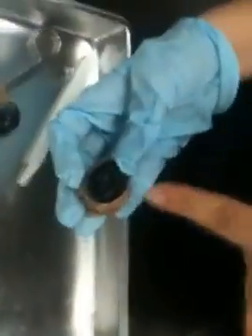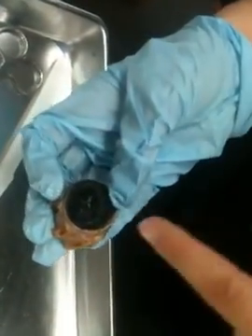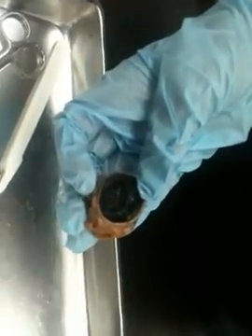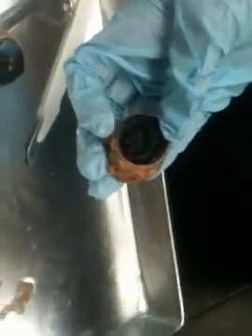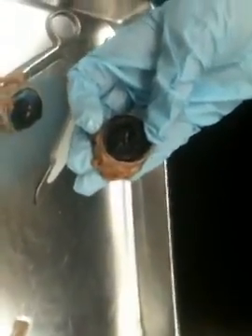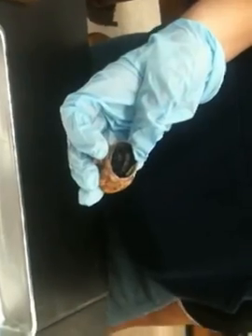Okay, so like I was saying, you can see the opening there of the pupil. It's just a hole. And then there's all these little indentations around it. So that's the ciliary body. You can see that in the model. See, it's just like the little indentations on the inside. Is that where the muscles are, or what? Yeah, so the ciliary body and the iris are actually muscles, right? And that's what's actually contracting or relaxing to change the shape of the lens or the size of the pupil.